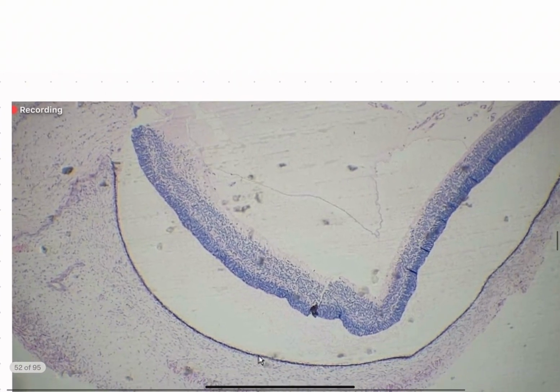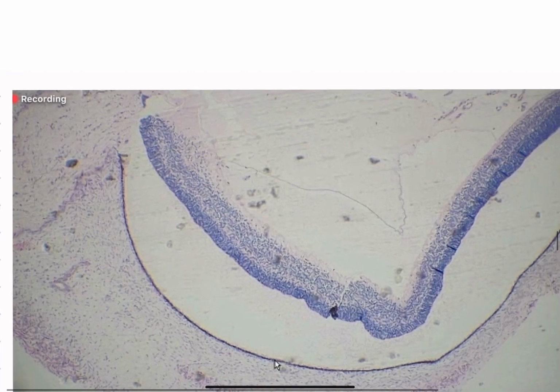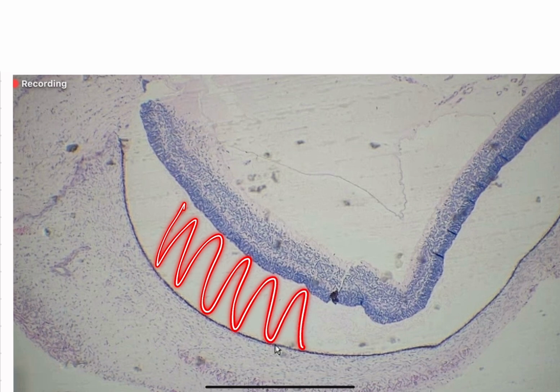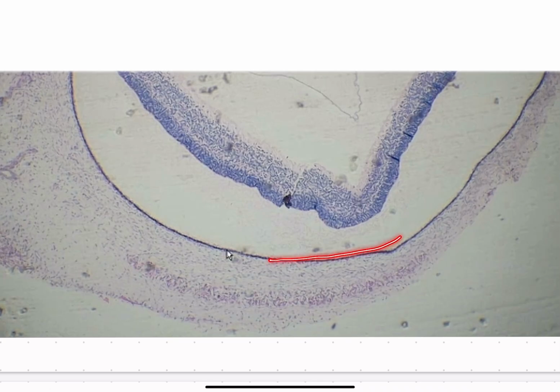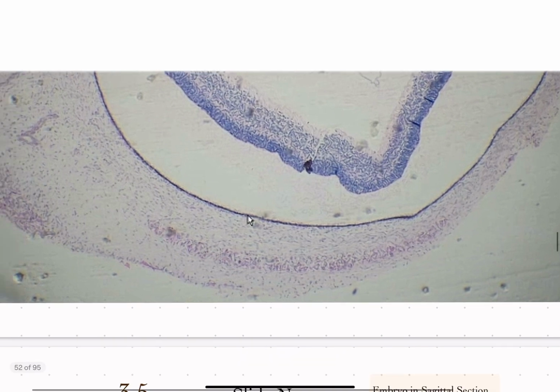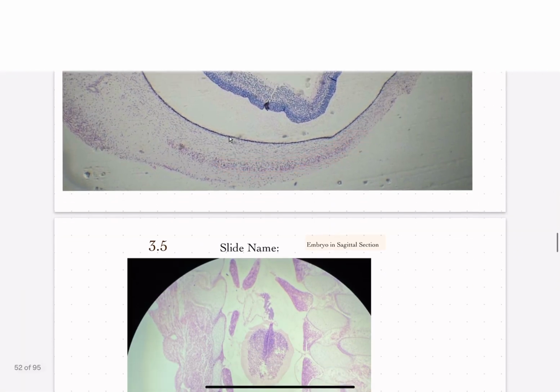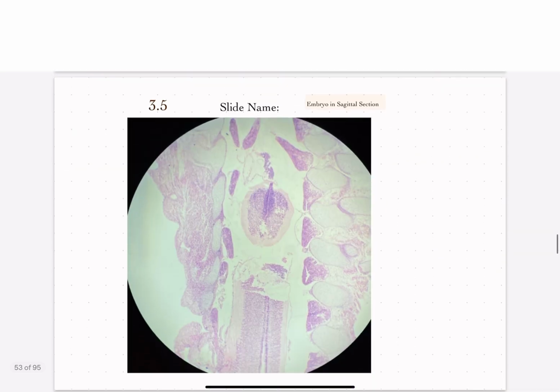Double check me. I did not have that structure in my colloquium, but I believe that's also something that they could ask you. And then we also have the intraretinal space. Then underneath here, we also have that pigmented epithelium. They can ask you about the choroid, which is directly underneath the pigmented epithelium, which has all of the blood vessels, or the developing sclera, which is a lot lighter part, which is underneath the choroid instead. And these are some muscles, I believe, muscle cells.